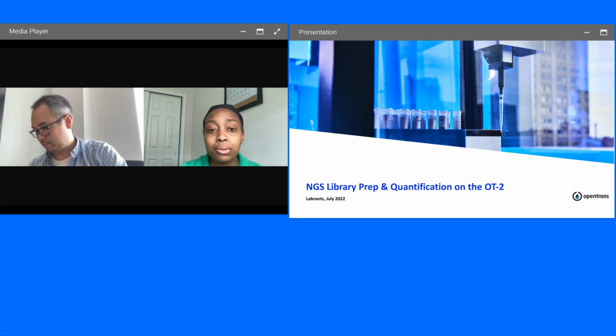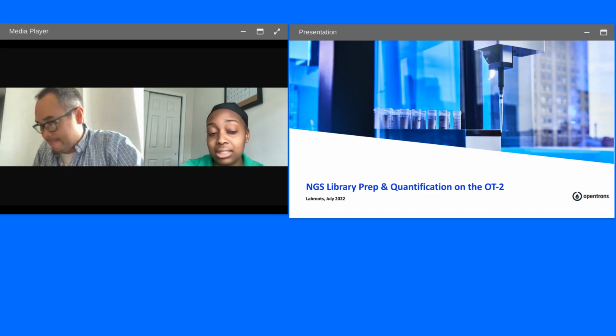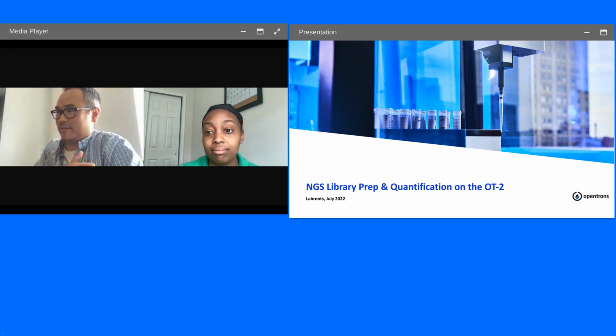I have one more question for you, Matthew, here as we're coming up at time. Can the OT-2 perform any other NGS steps such as extraction? Yeah, so if you remember my presentation slide of all the steps, one after the other, extraction is the very first one. I've been able to incorporate a version that works for me with the setup that I like. All the extractions are basic bead extraction kits.